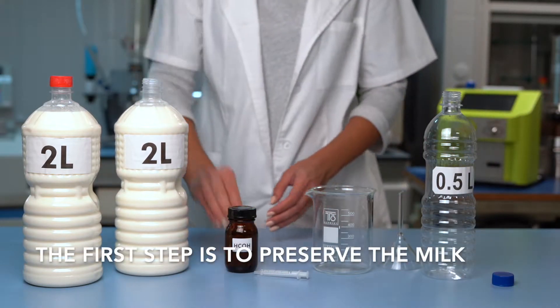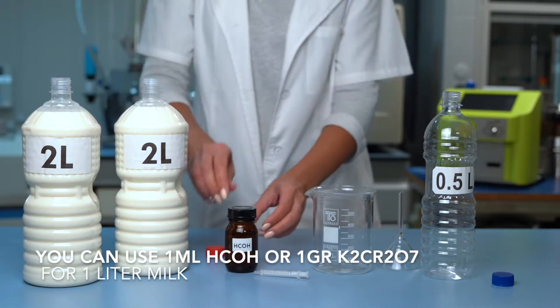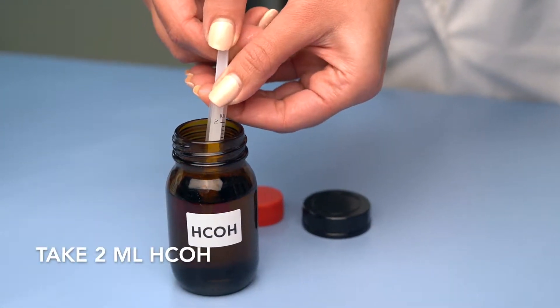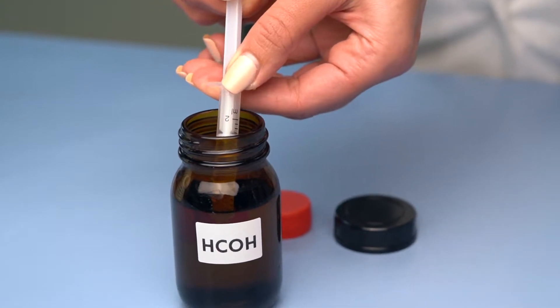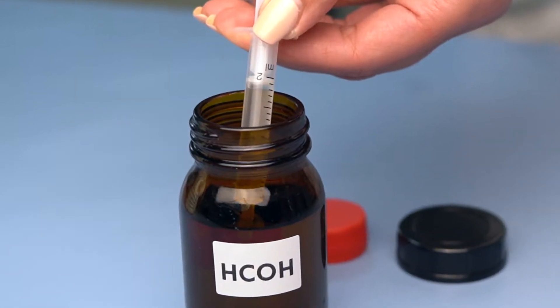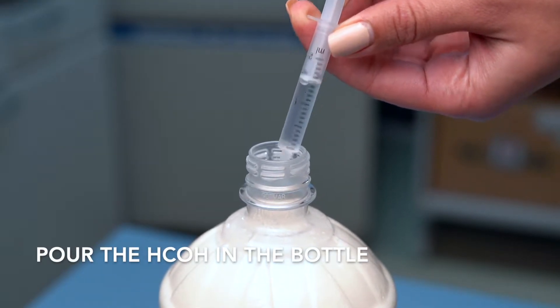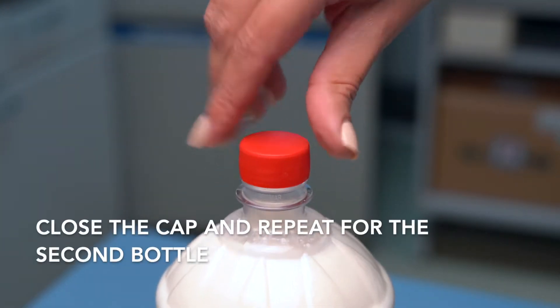The first step is to preserve the milk. You can use one milliliter HCOH or one gram K2Cr2O7 per one liter of milk. Take two milliliters of HCOH, pour it into the bottle, close the cap, and repeat for the second bottle.